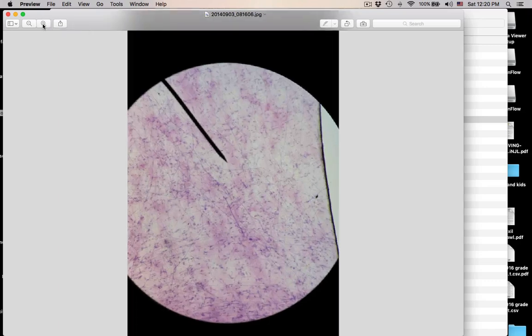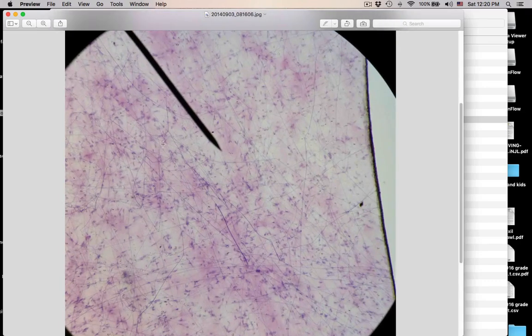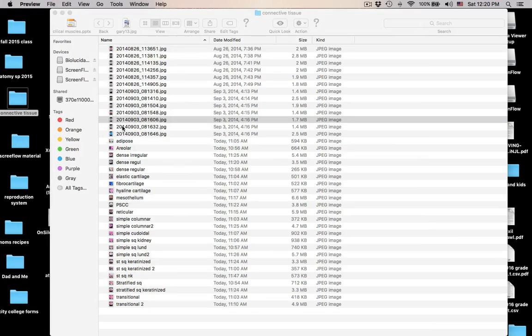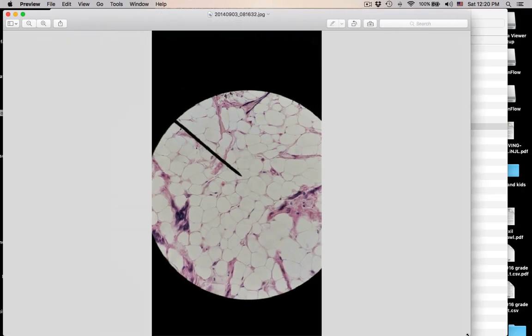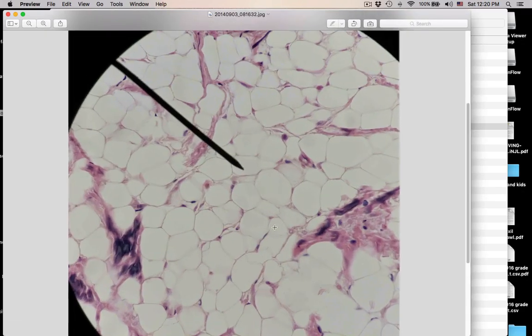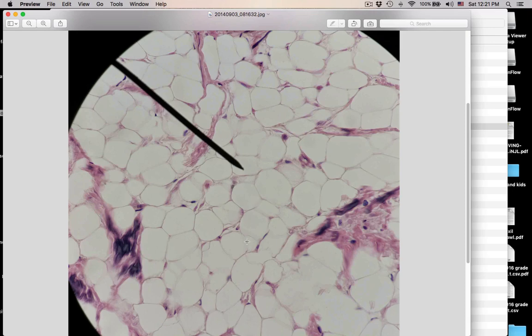What is this? Areolar connective tissue. And here — adipose. Some students confuse this with simple squamous, but it's not. Here is a space where fat used to be stored; all these are fat-storing spaces and the nuclei are pushed out to the side. You just see one nucleus per cell. This is adipose tissue — classified as connective tissue proper, a loose connective tissue. It is a vascular tissue.